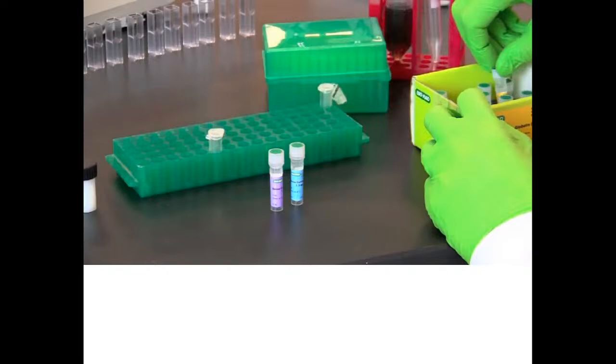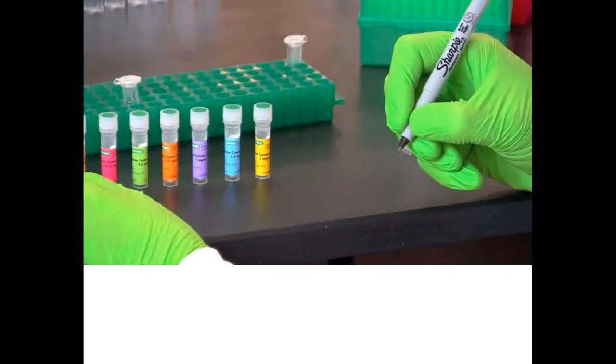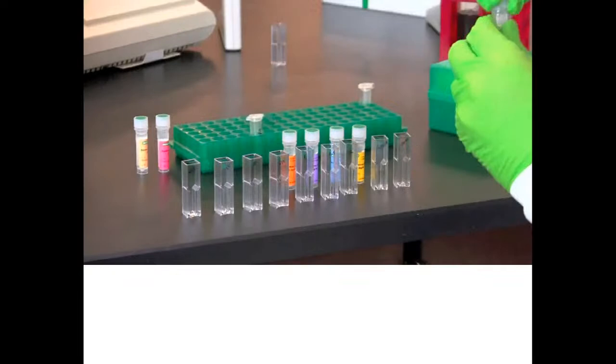Next, we will set up protein standards. See your protocol for the correct concentrations. Label a cuvette for each standard and mark it with the corresponding concentration. Next, add 20 microliters of each protein standard into the corresponding cuvette. Make certain you use a clean pipette tip for each sample.